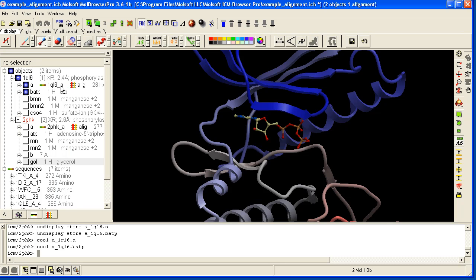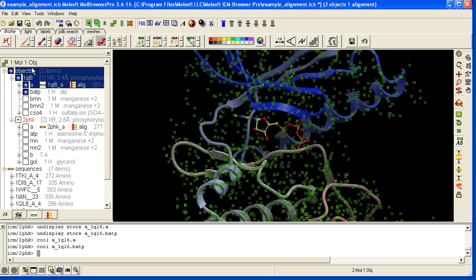And whatever you select is also reported here. So I'm selecting one molecule of one object here.